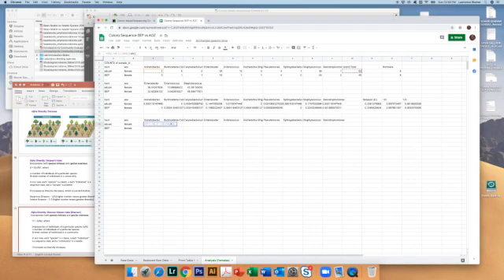And again, it's the same formula, C3 divided by $M3, and then two close parens, and then comma, and then put two quotes. The reason you're putting in two quotes and then a close parenthesis is this is what the formula means. It's saying if this cell, C3, is greater than 0, do this calculation. But if it's not greater than 0, if it's 0, or it can't be less, but if it's 0, then just leave it blank. That's what we want it to do.